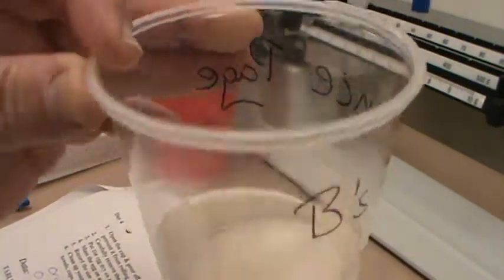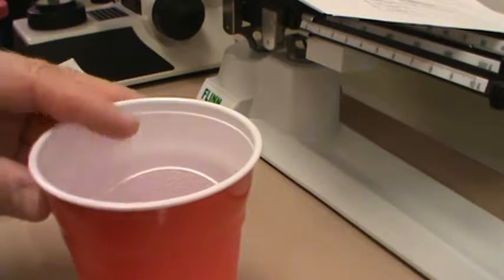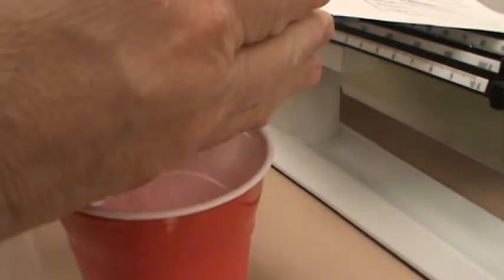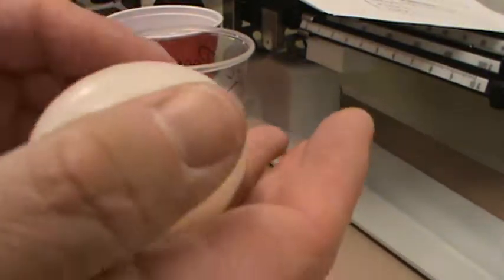And so I have distilled water still around it. We're now going to pour that water off. So let me put the paper out of the way so we don't get it wet. We're going to pour the water off just like that. There's our egg this morning. And the egg has a nice bright color.